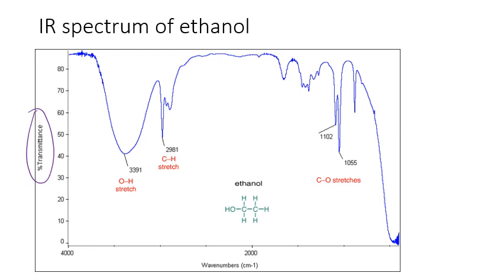It is often termed a supporting analytical technique, as the only information it really provides relates to the presence or absence of certain chemical bonds associated with different functional groups and molecules. It provides little other structural information. However, it is a powerful technique in making some key decisions at the beginning of working out what a compound is. And usually it's a start for an organic chemist on this journey to determine what the compound would be.